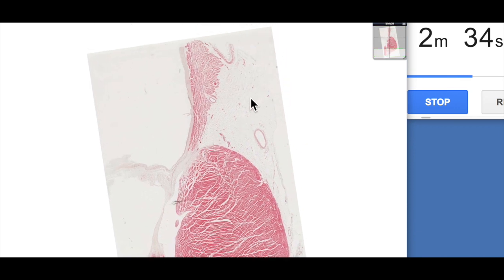So the heart's made up of three layers. It's made up of an epicardium which is this tissue here. Normally there's a simple squamous lining on the surface. Often that gets removed when we process for microscopy and so this is the epicardium.